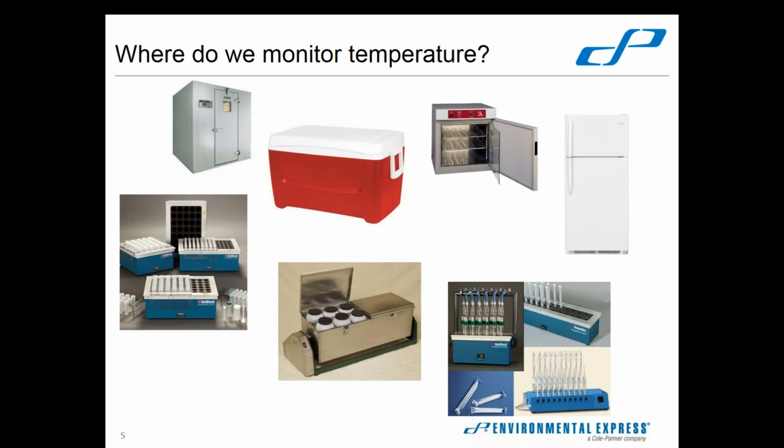Where are we monitoring our temperatures? Wow, I just realized that the top right picture is white on white, and it's really hard to see. It looks better on my other monitor. That's a refrigerator type incubator, for those of you who may not be able to really see that top right image. That looks just like a couple of lines right now.